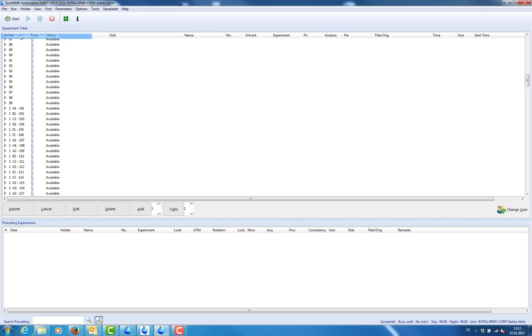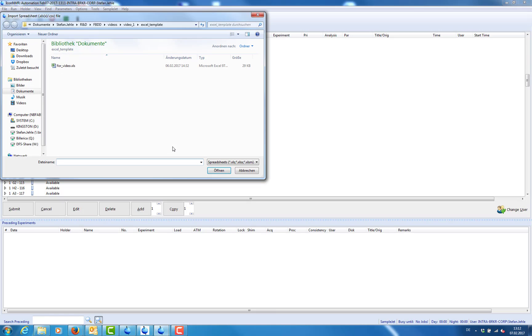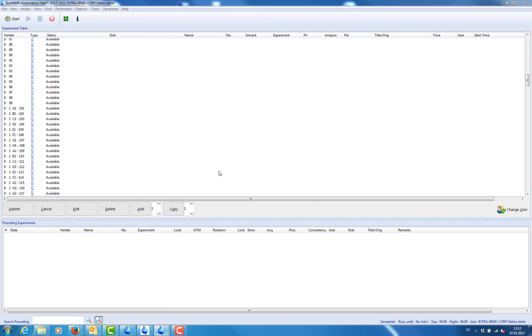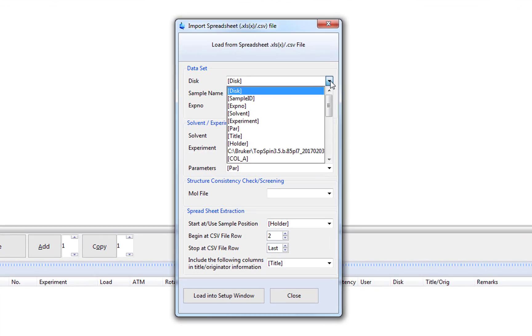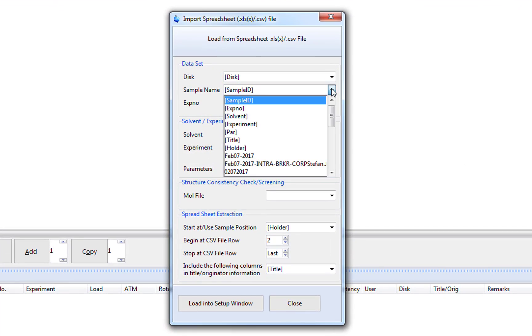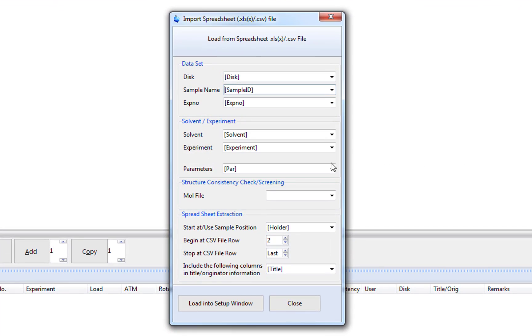After opening IconNMR, we can import the spreadsheet into the setup window. From the import dialog, we can choose which columns should be imported and which columns contain the sample position.